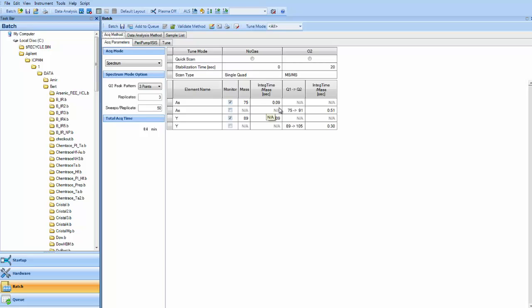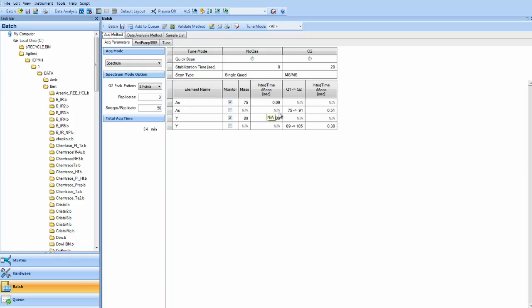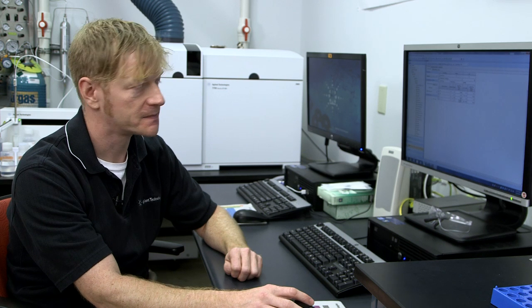We're also spiking in some high REE samples, neodymium and samarium. They have masses of 150, among others. But that mass of 150 can be an interference at mass 75 by a double charged ratio. So I have spiked 10 ppm samarium and neodymium into the samples to show the removal of that interference.